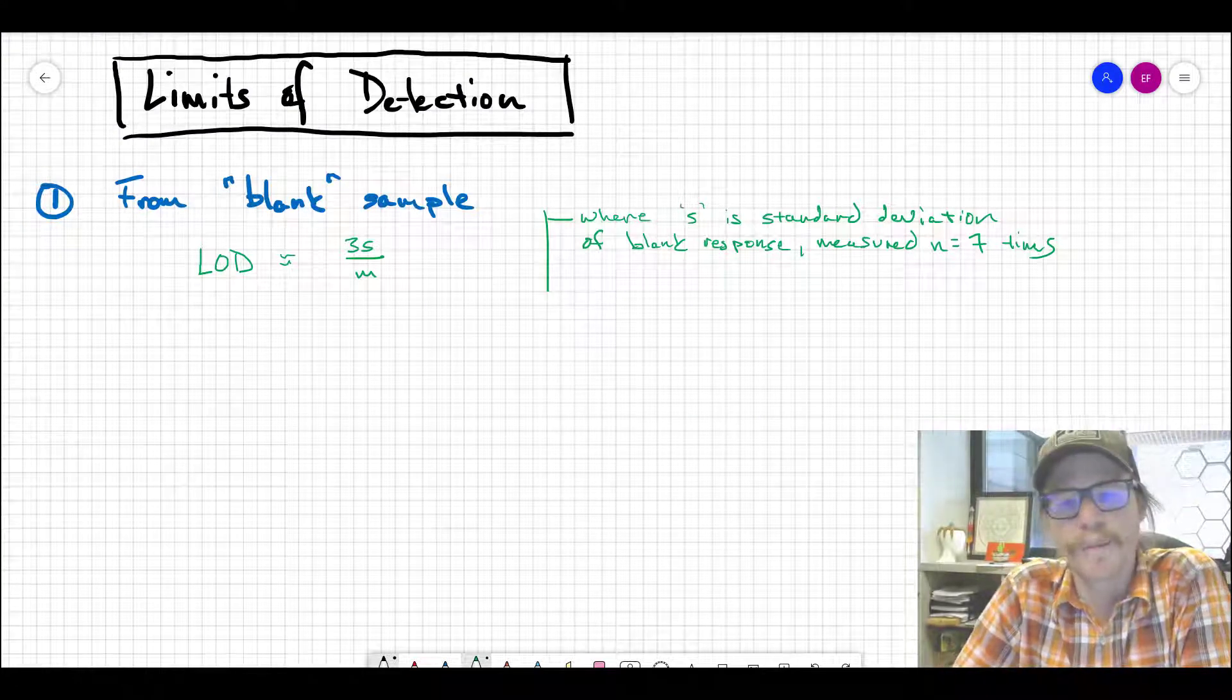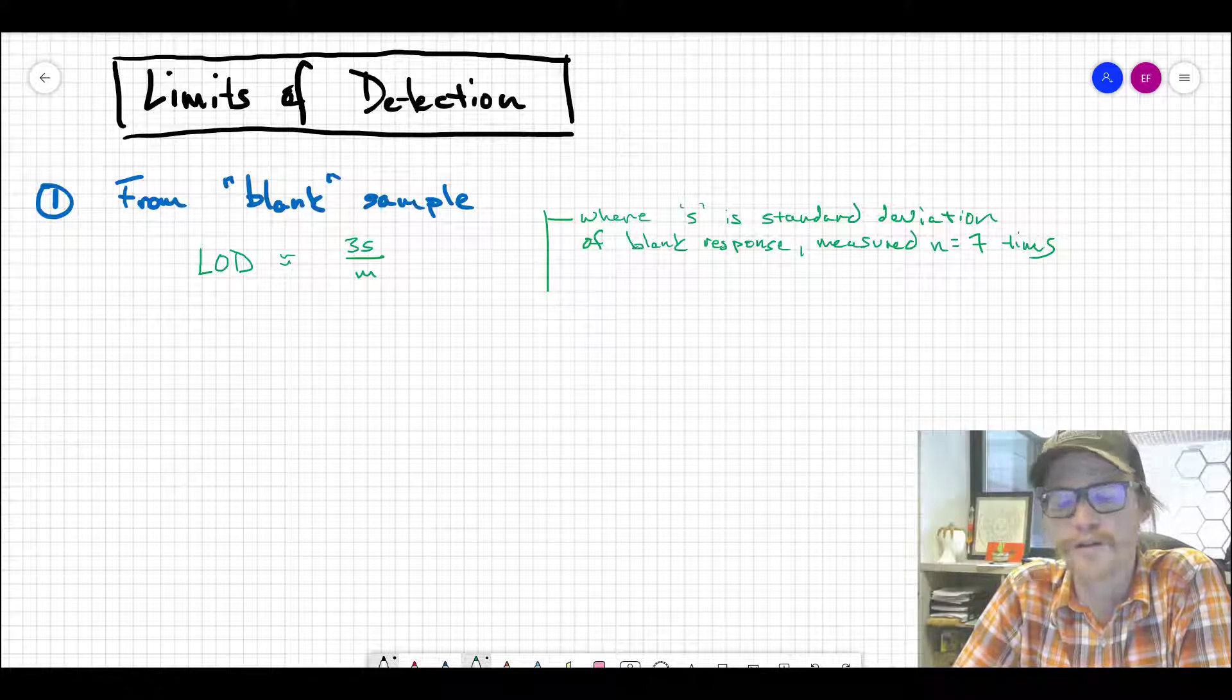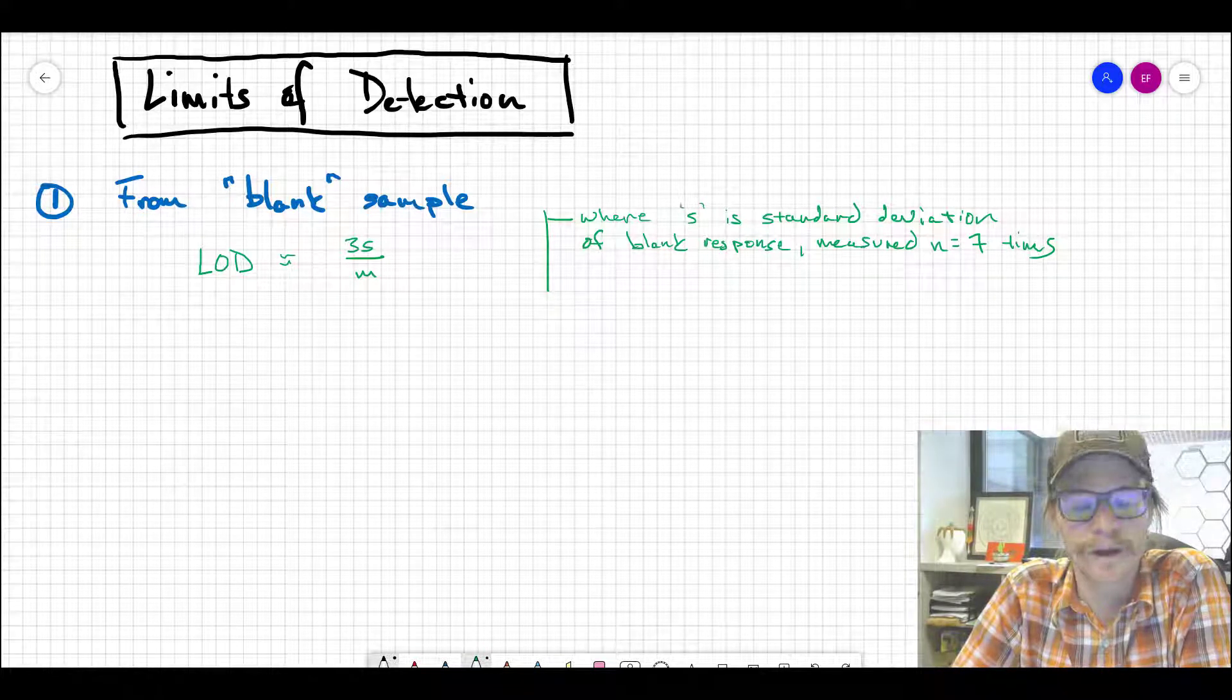I gave you a short prelude to limits of detection and quantitation in an earlier video, but now I'll give you more information and show you an Excel setup.